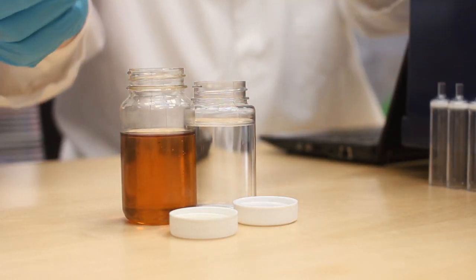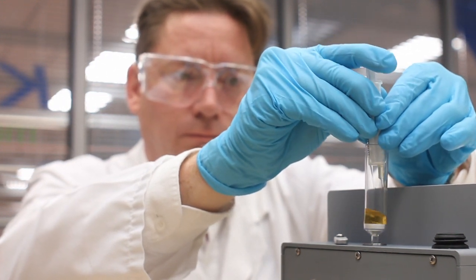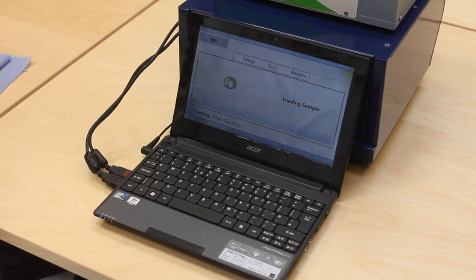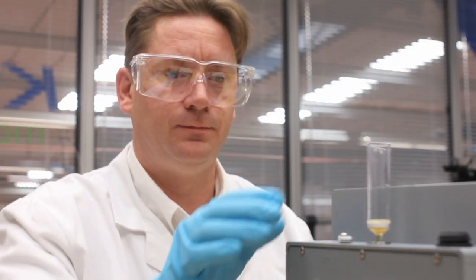Then a small oil sample is placed in the sample tube. The simple-to-use, fully automatic software then draws the sample into the unit where it's measured and analyzed.